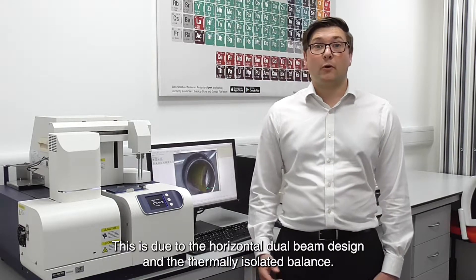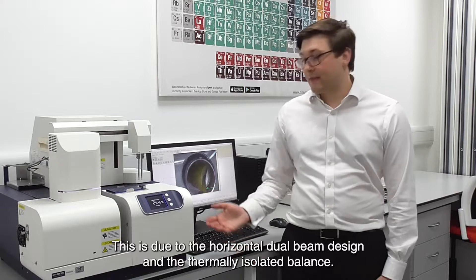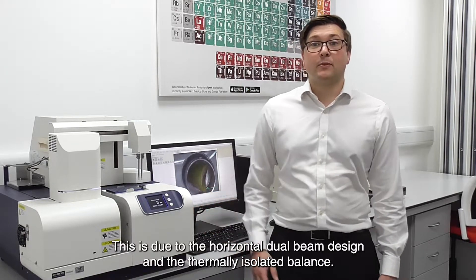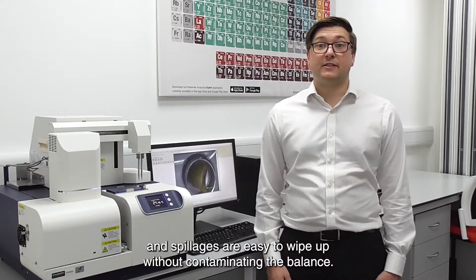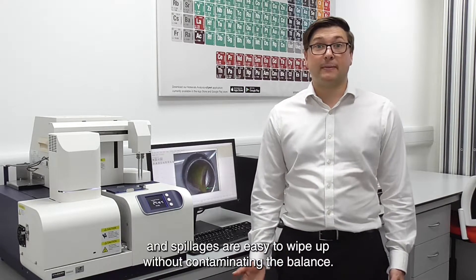This is due to the horizontal dual beam design and the thermally isolated balance. It also allows any dropped pans to be easily recovered, and spillages are easy to wipe up without contaminating the balance.